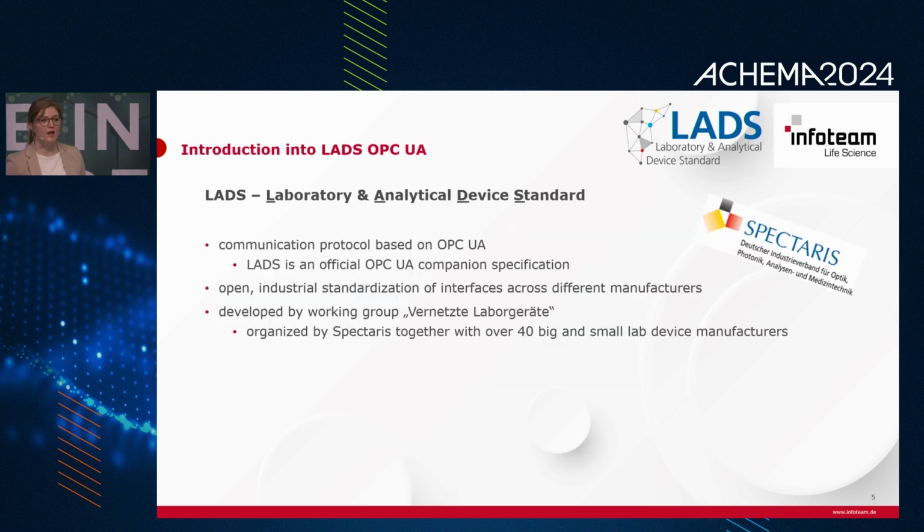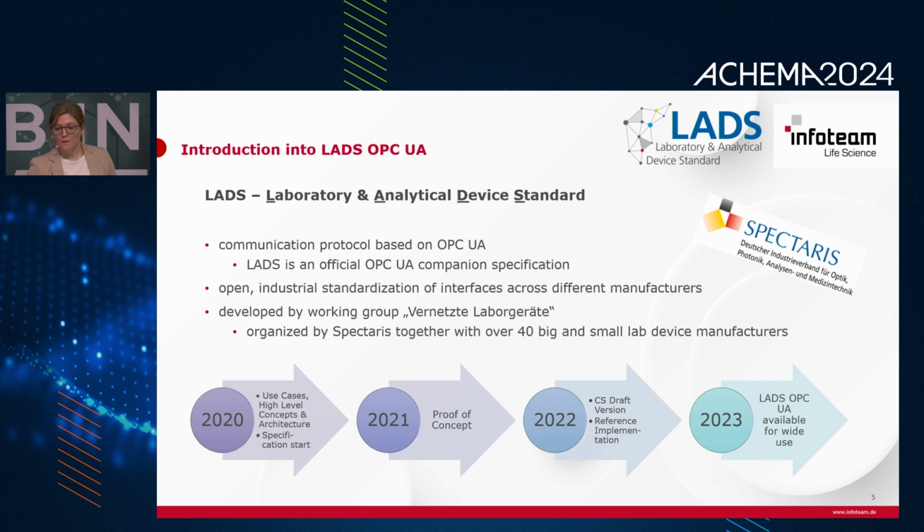So LADS stands for Laboratory and Analytical Device Standards. It's a communication protocol based on OPC UA and aims for the standardization of interfaces across different manufacturers to connect your lab device fleet. LADS was developed by a working group organized by Spectaris with over 40 manufacturers. They started in 2020 with possible use cases, concepts and specification, and it was just released end of last year.